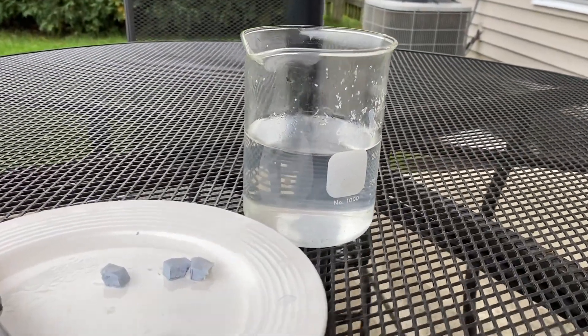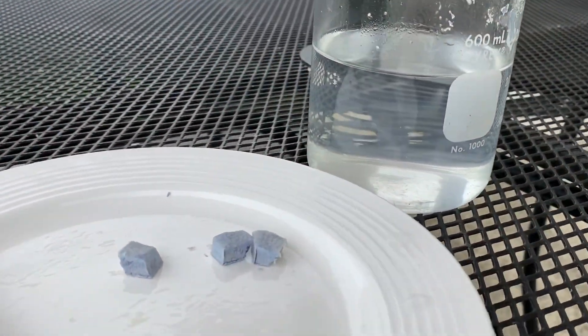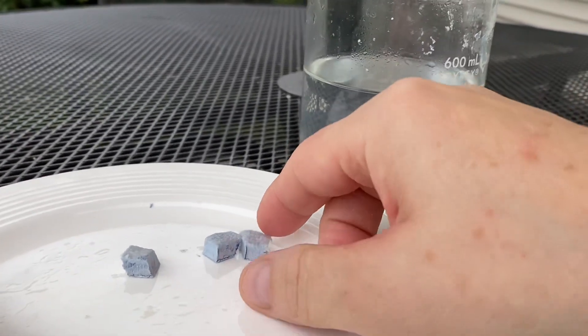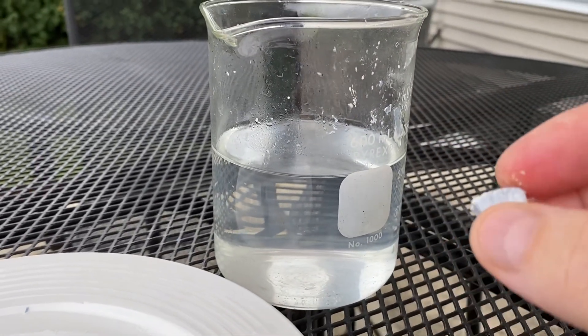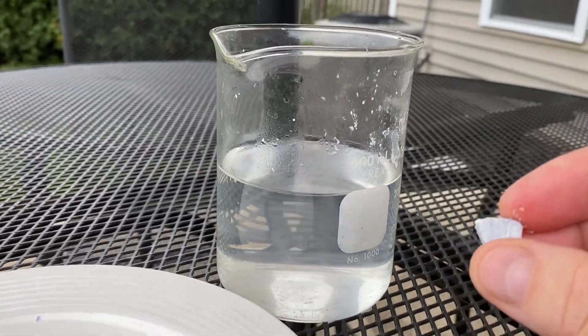And now for the fun part. We're just gonna put a small piece of potassium metal in water. This is gonna release hydrogen gas, it's gonna turn into potassium hydroxide and water vapor. You'll probably see a little bit of fire. Here we go.